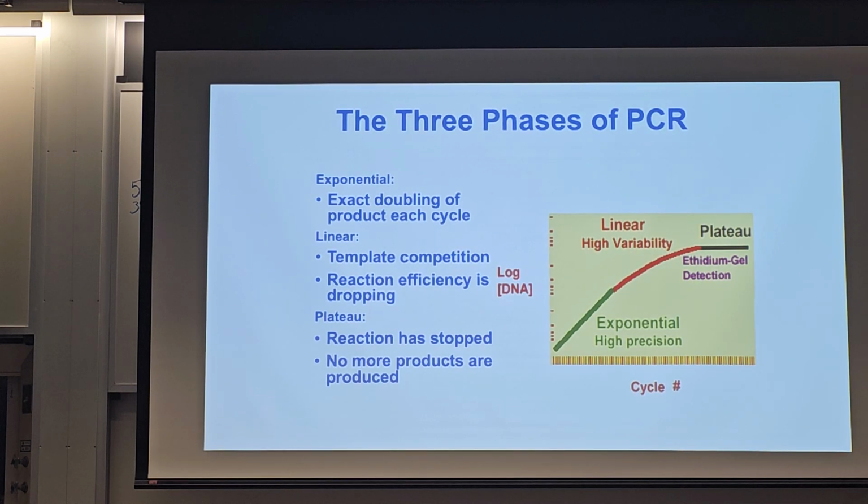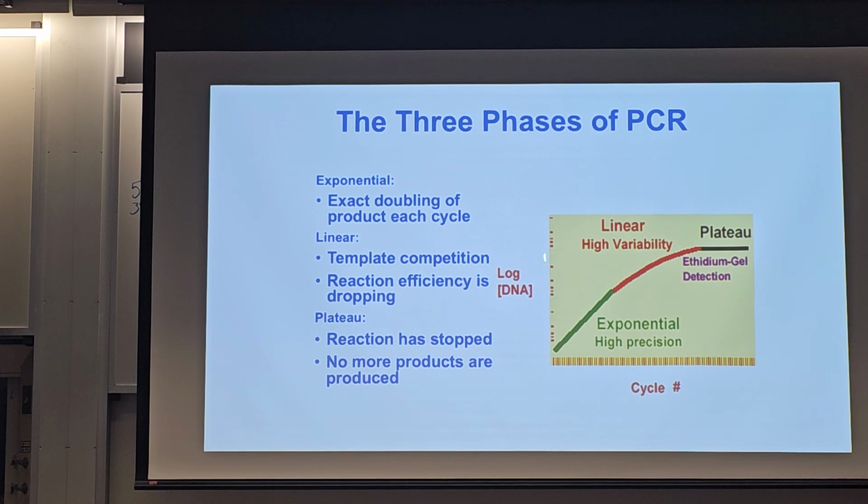All right. These are images I got from Applied Biosystems, so they're not mine. I apologize for the fact that they're a little bit crude. But this is what your curve's going to look like. I'll show you better curves later. What's going to happen when you do PCR? The number of cycles is the x-axis here. The y-axis is the log of your number of DNA products. You're not actually looking at the number of DNA products, you're looking at fluorescence here, as our method for measuring how much DNA we have.